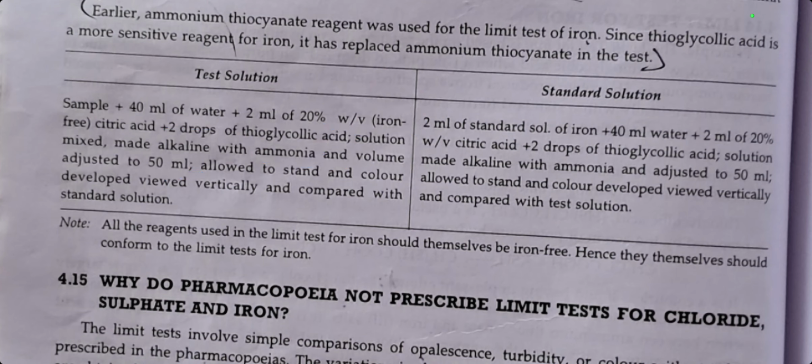In the standard solution, except for the sample, we add all the same reagents that we added in the test solution. That means 2 drops of thioglycolic acid, made alkaline with ammonia, and adjusted to 50 ml. Allow to stand, and the color developed is viewed vertically and compared with the test solution. Here, the prescribed quantity of standard solution is added in the standard cylinder, and the remaining reagents are the same as those added in the test solution.